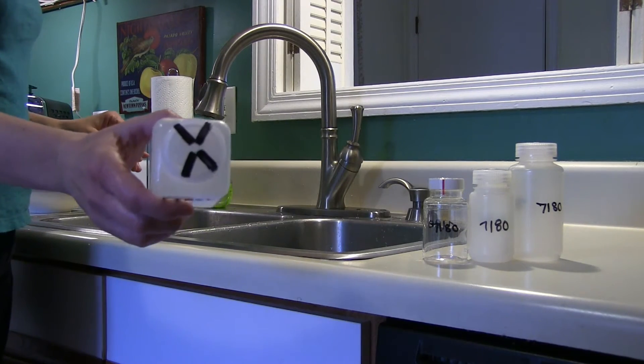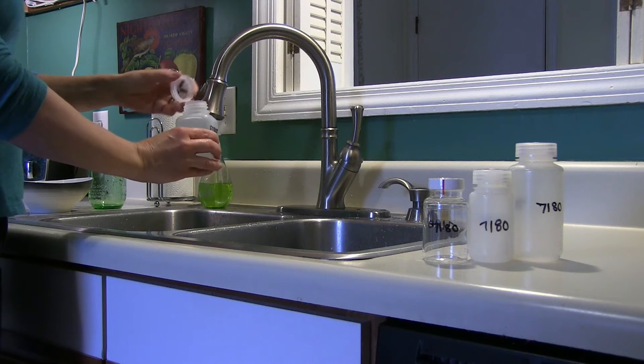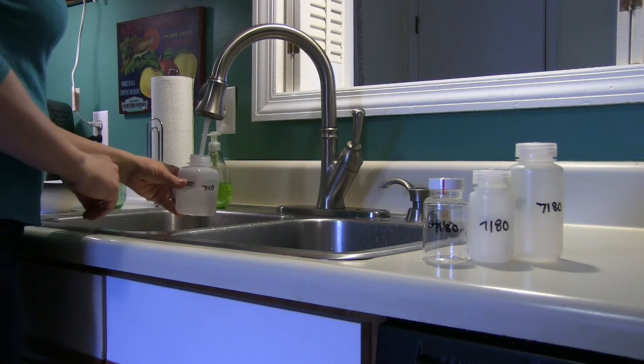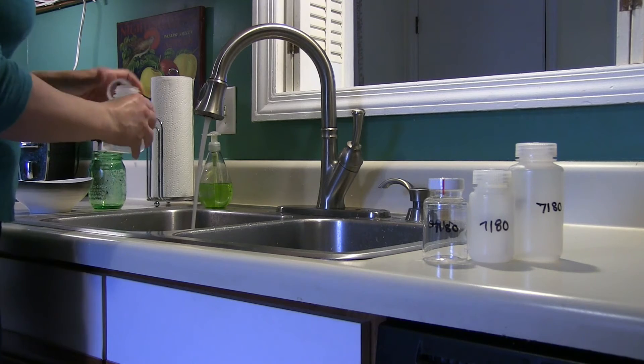First thing in the morning, before using any water in the house, find the bottle labeled first with an X on top. Holding the cap in your hand and placing the bottle under the faucet, turn the water on fully as you would to fill a glass of water and capture the first water out of the faucet.